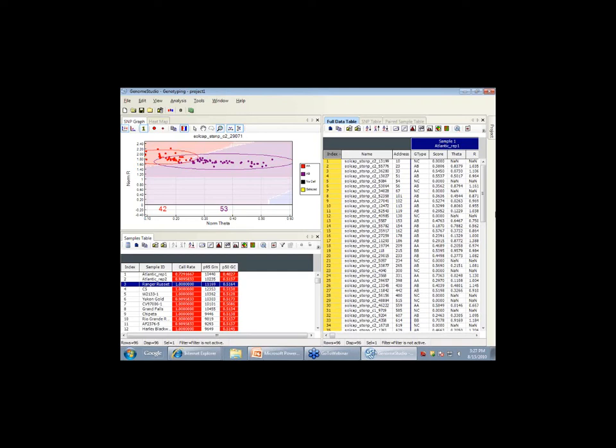They do have a phenotype column where you can add phenotypic data in CSV format, but all it really does is display data. It'll show your phenotype in red and your SNP in red, so you could make pattern-type associations in a heat map, but there's no statistics around it whatsoever. It might be pleasing, but I don't think it's going to hold water, and I wouldn't make any decisions on it. So you probably shouldn't use this as a phenotype-genotype tool.